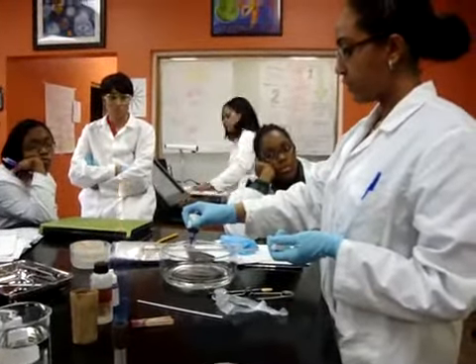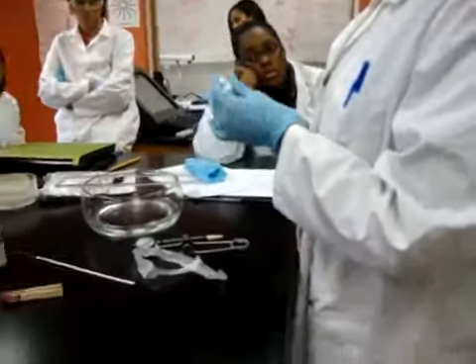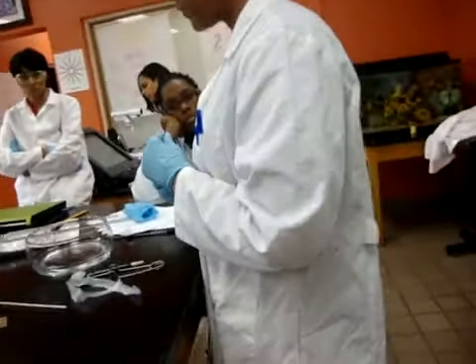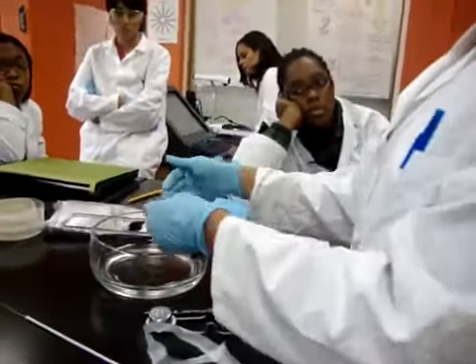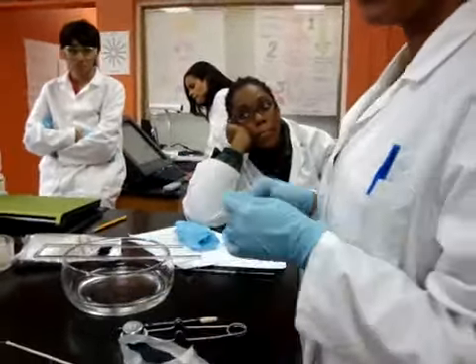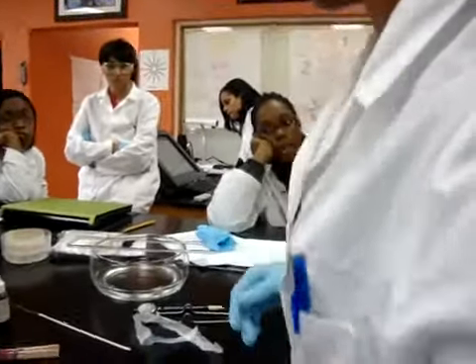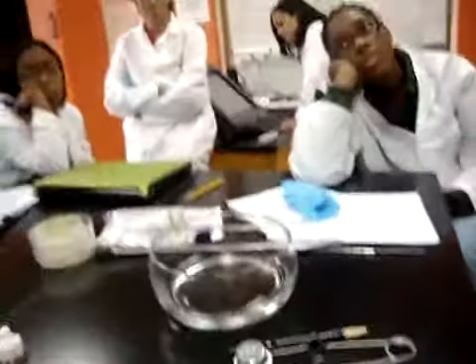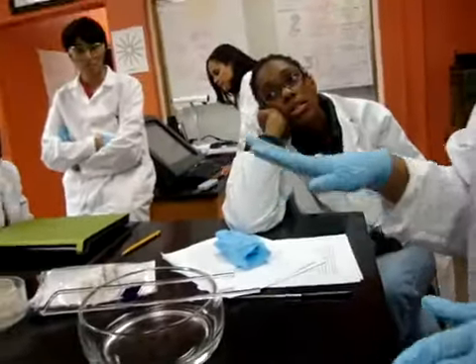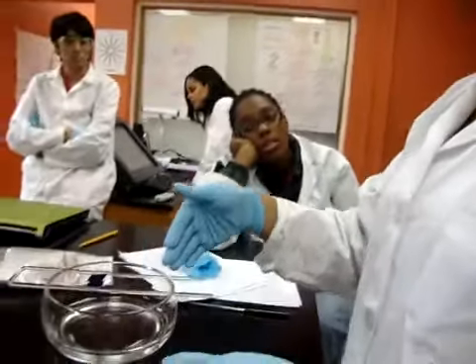Put my drops of crystal violet to cover my smear. And you have timers on your bench. You need to leave each stain on for a minute. So we leave that for a minute, but if I had the other two ready, I could just put the dye on all three and leave them to set for a minute. It says you've got to cover it completely. Just cover your target circle completely. Leave it for a minute, then I'll wash that off.